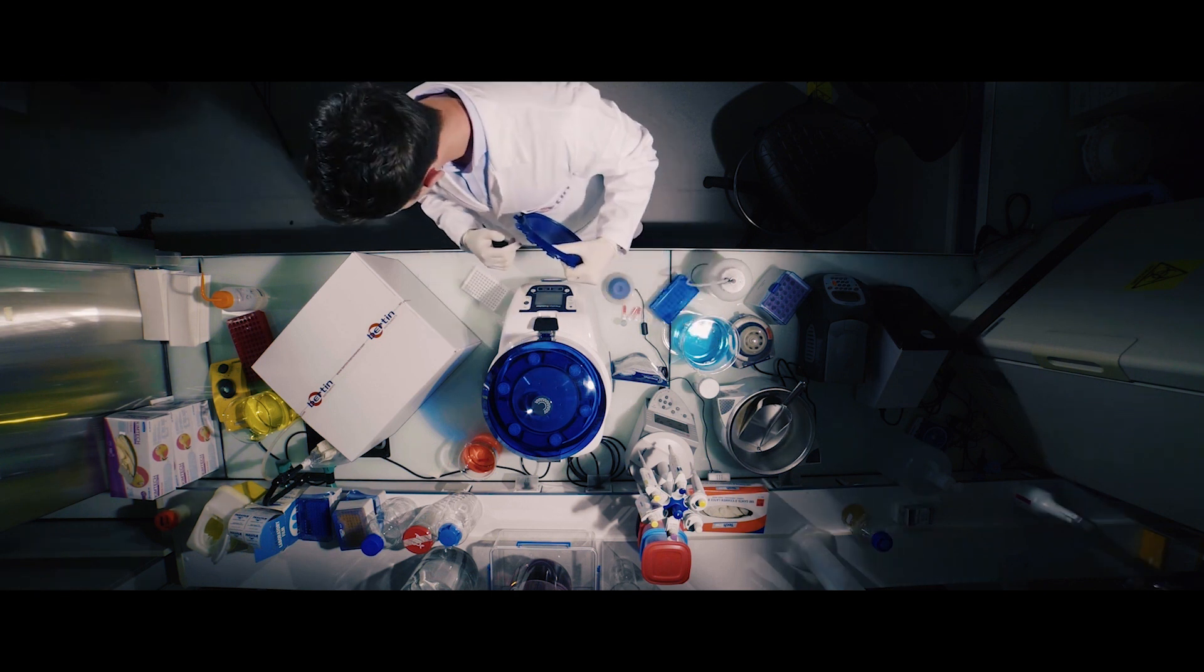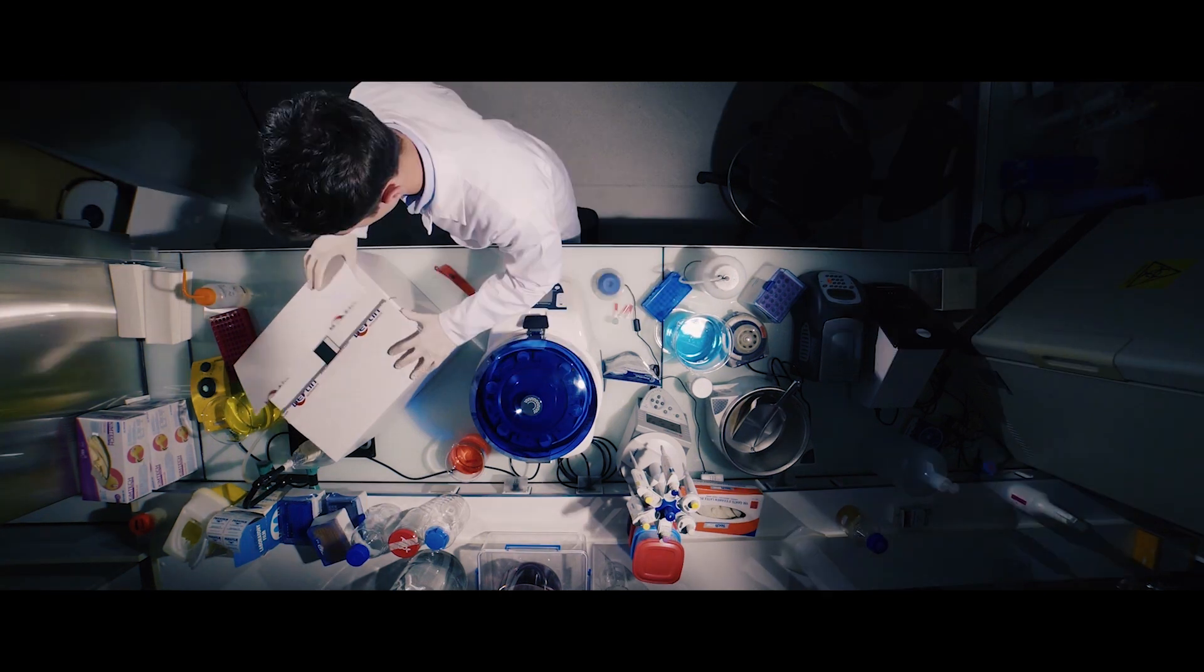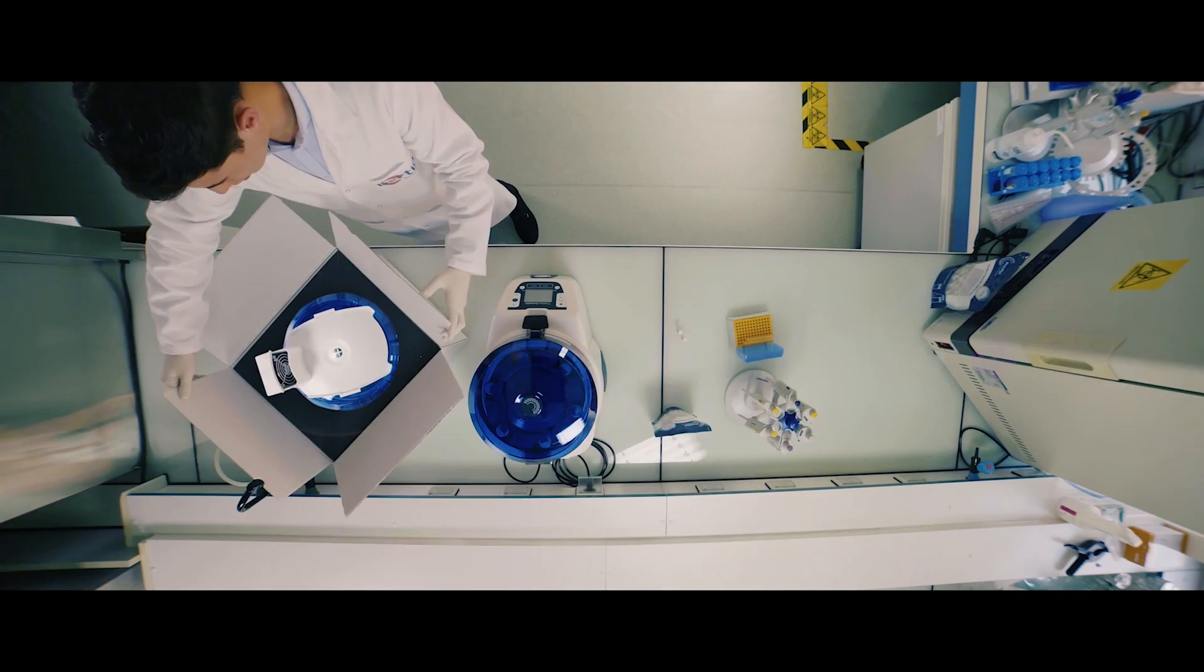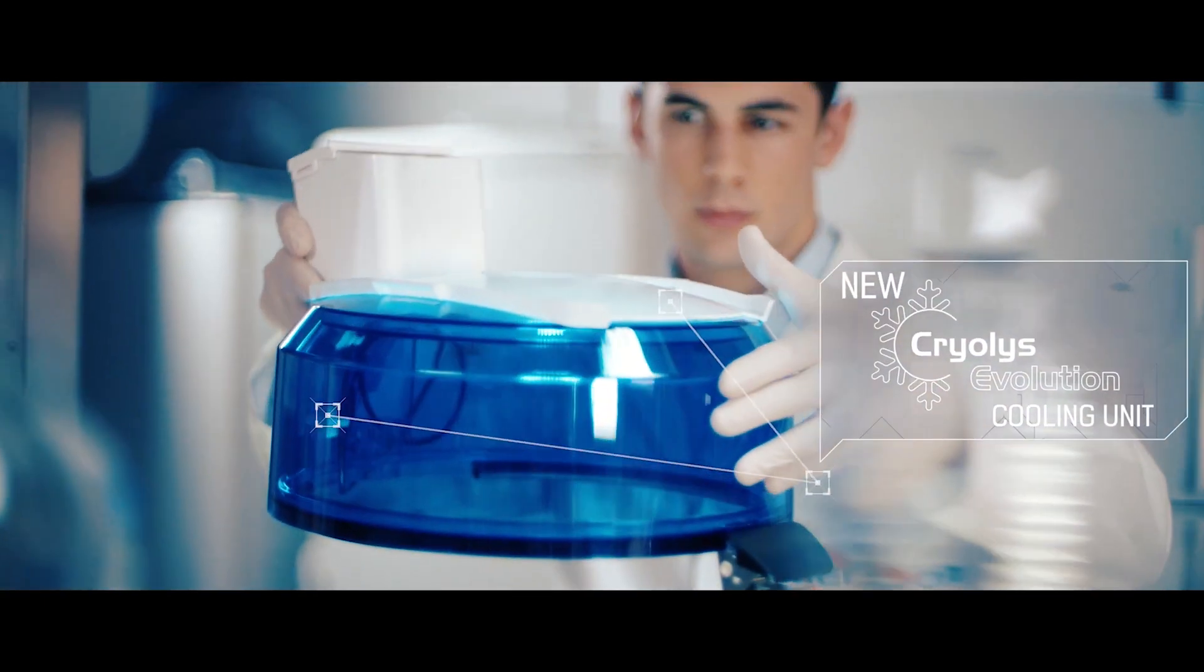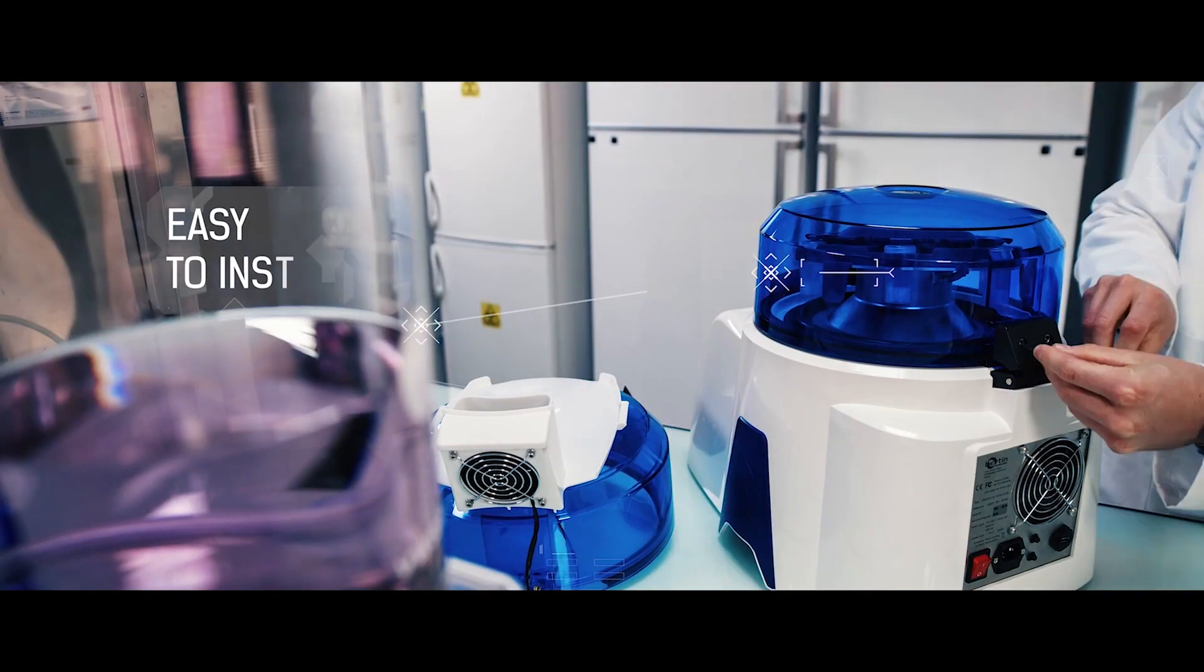Do you need to perform cold homogenization using minimal bench space? Cryolis Evolution is the new cooling unit for sensitive sample preparation.